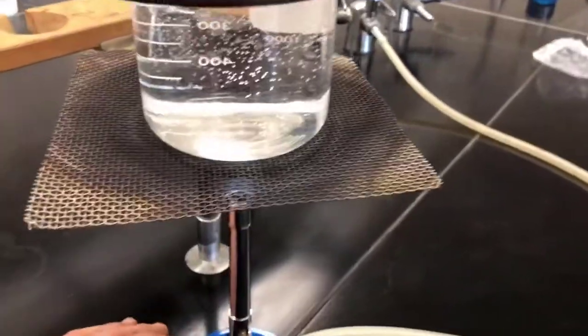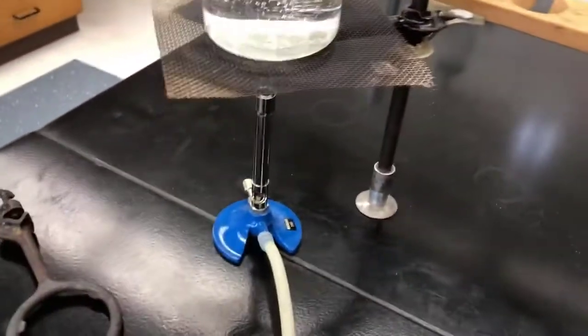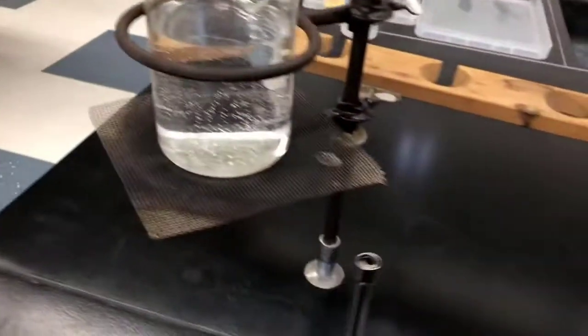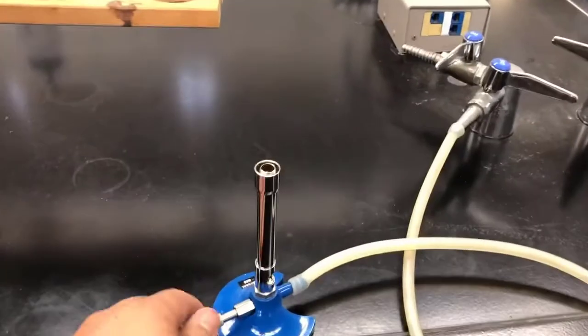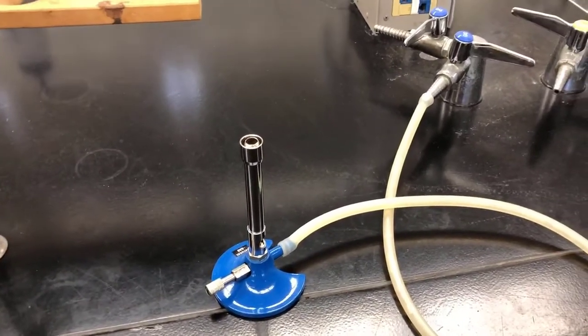So if you come down here and it's too hot to handle — which it's not at this point — what you can do is simply go to the gas and shut it off. You can slide it out from underneath just by pulling on the hose, and then you can turn this thing down and off, so it's not on for the next time you use it.